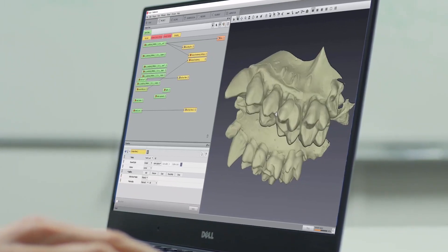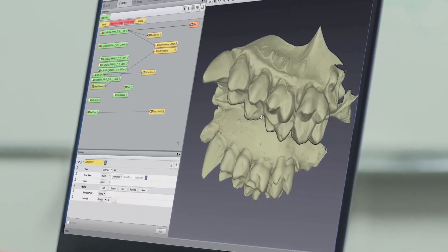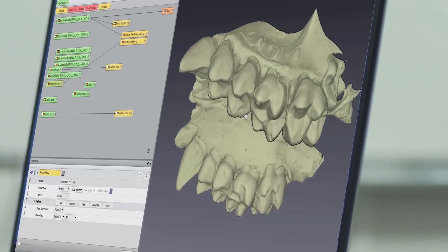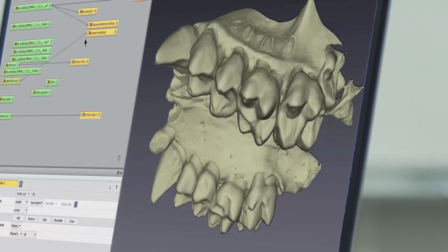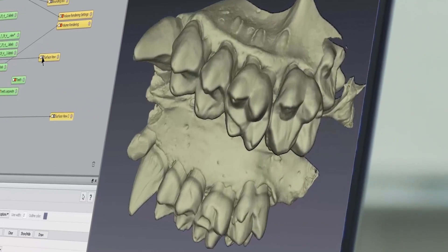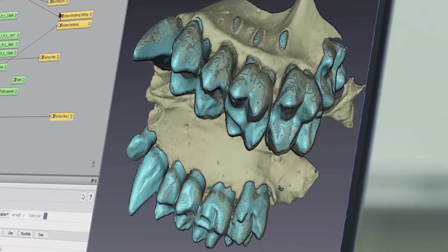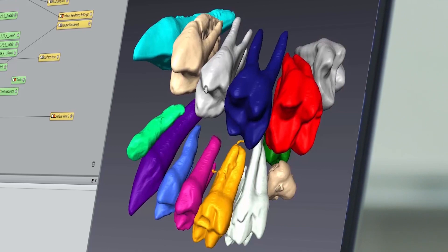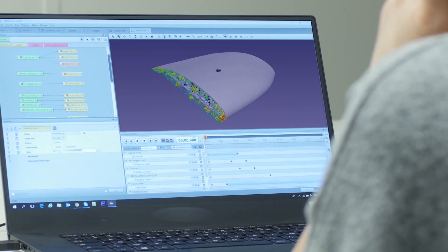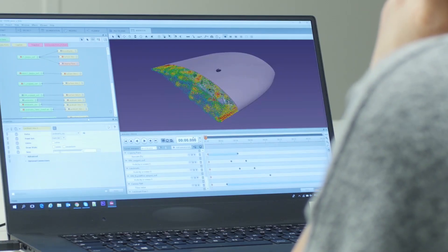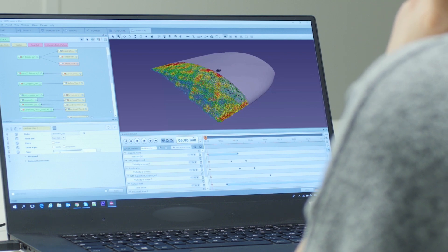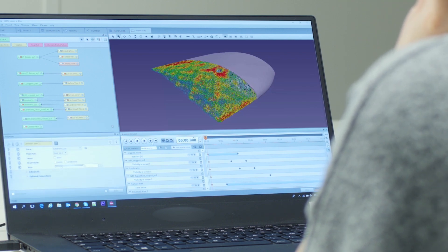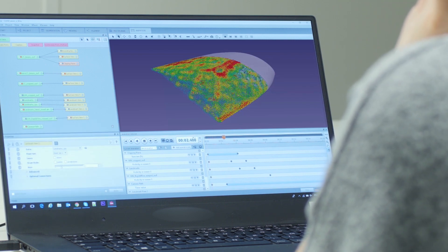There's a wide range of segmentation algorithms, depending upon if you want to do manual segmentation for archaeological type specimens or paleontology, all the way through to automated methods such as binarization techniques, which we can apply to things like turbine blades or automotive parts.